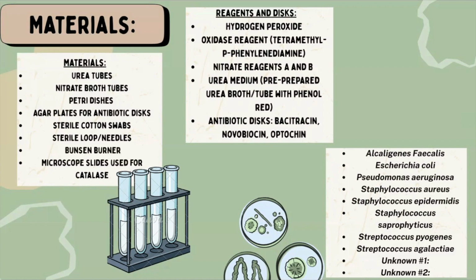P. aeruginosa, S. aureus, S. epidermidis, Staphylococcus saprophyticus, S. pyogenes, S. agalactiae, and unknown 1 and unknown 2.